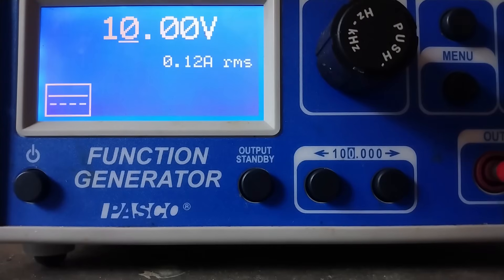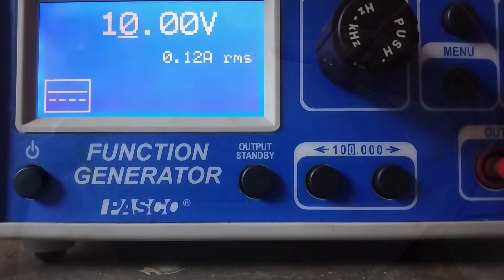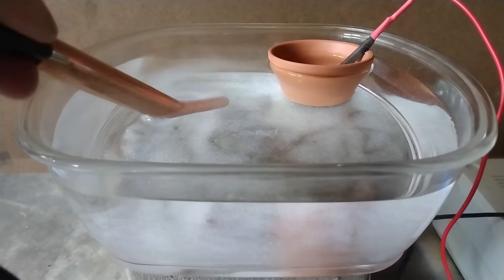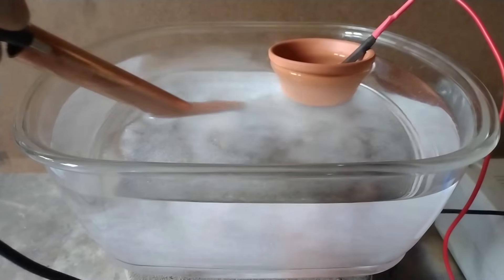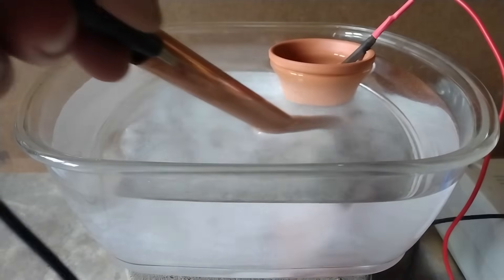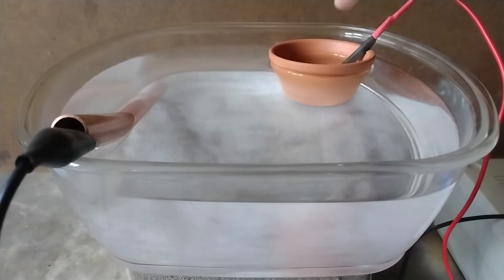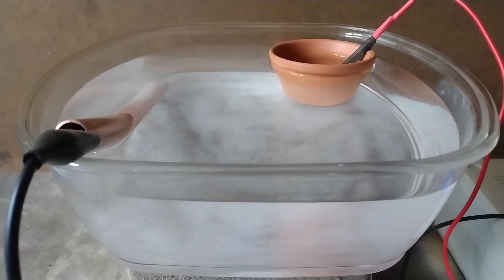It has been one hour and there is now a current of 120 mA. We can see some reaction happening at the cathode and almost all the Epsom salt has been dissolved — there's still a little bit left, so we can stir a little bit. We don't see any change in the clay pot, but it should start to have some sulfuric acid in it — it should be a little bit acidic.